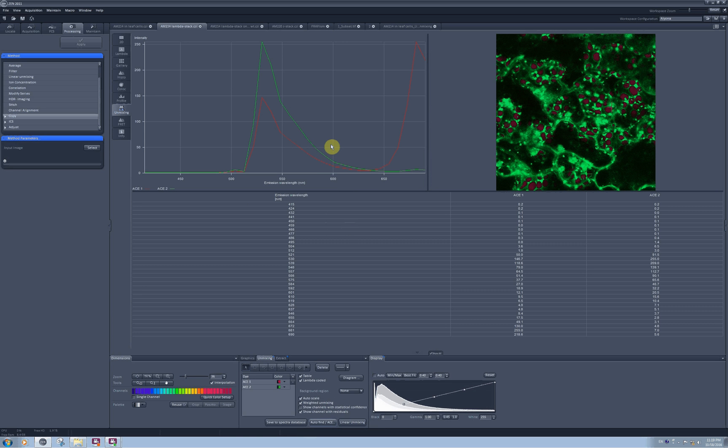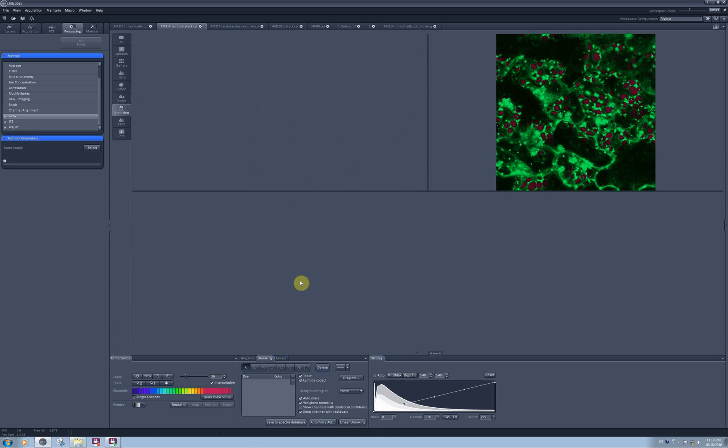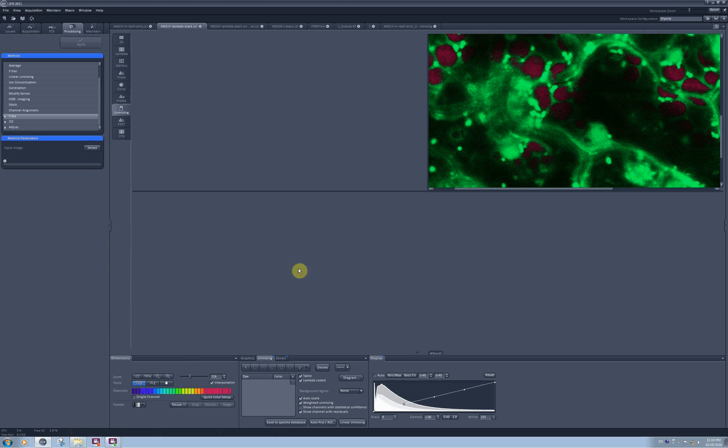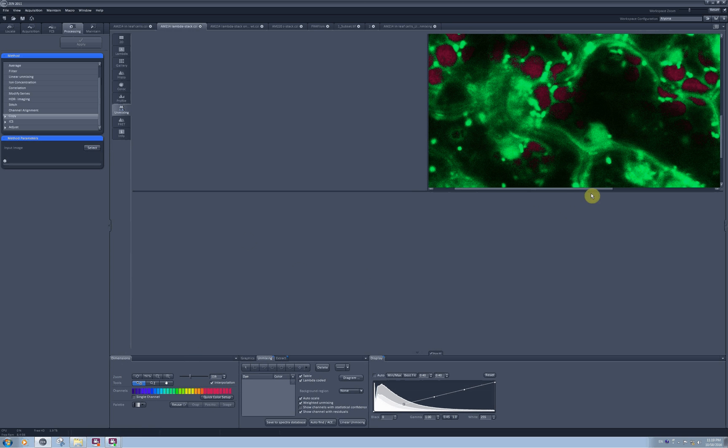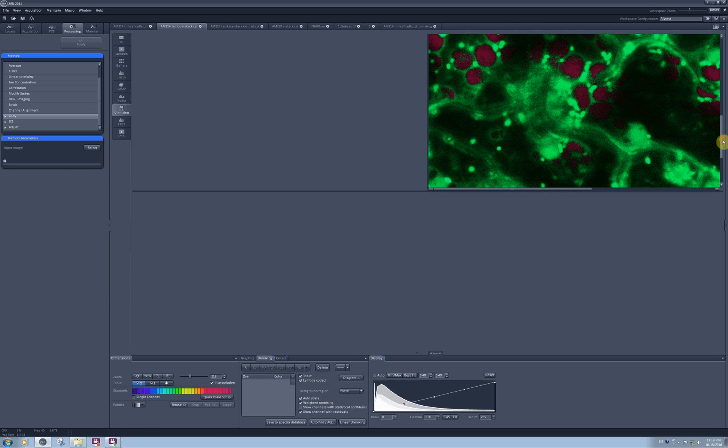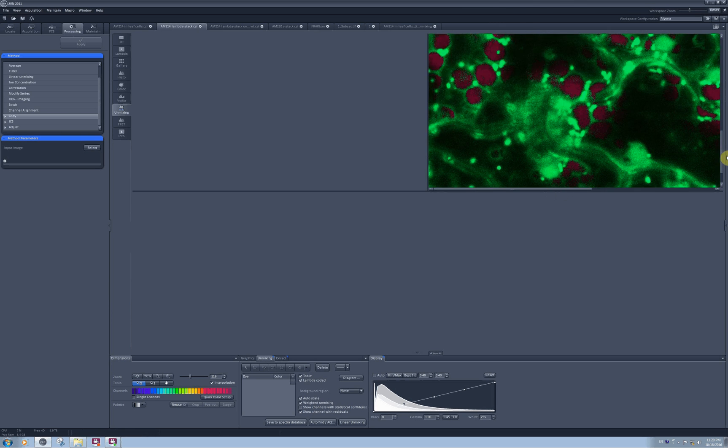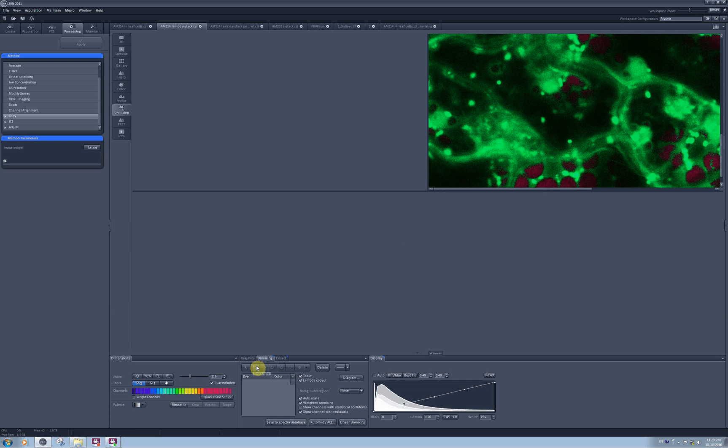Sometimes the automatic component extraction doesn't pick the best points on your image, and then it's better to go in manually. I will delete automatically extracted components and zoom into my image. I know that a greenish yellowish signal is localized in mitochondria where there should be no chlorophyll, and I can select structures which I think are mitochondria and which are as far away from chloroplast as possible. I think this is good enough.